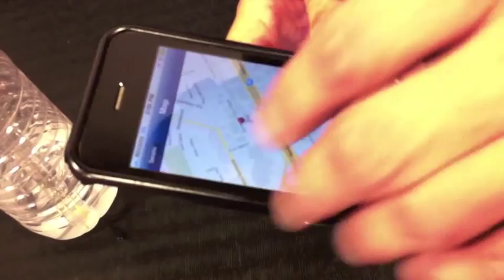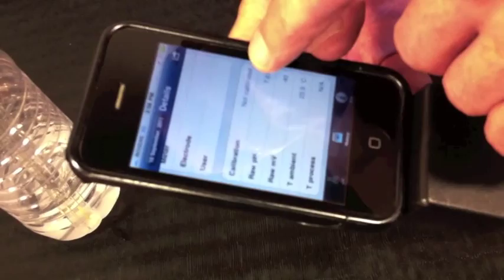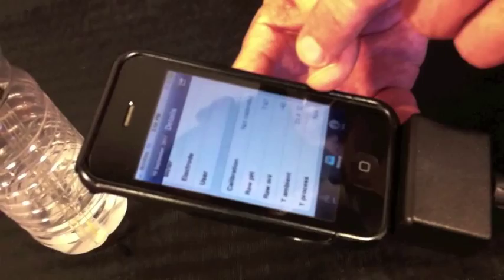It also lets you know when the sensor was calibrated, the actual raw readings from the instrument in millivolts, ambient temperature, and process temperature if it's available.